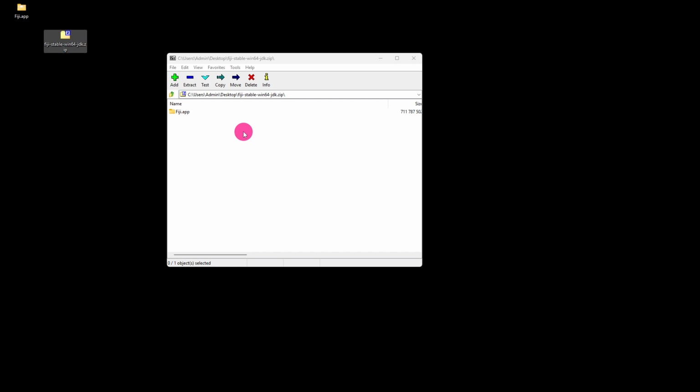If you are on a Mac, best once it's unpacked, you might need to drag it into the applications folder so that it properly works. So on Windows, not into programs. On a Mac, specifically into the programs or applications folder.